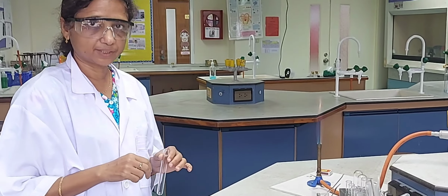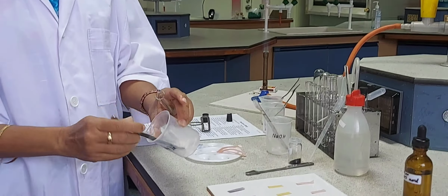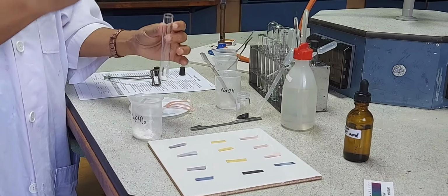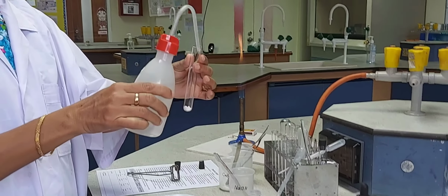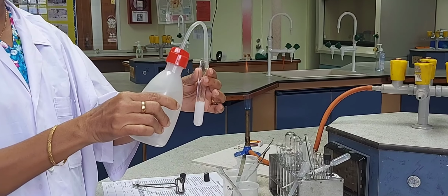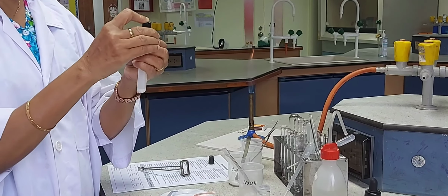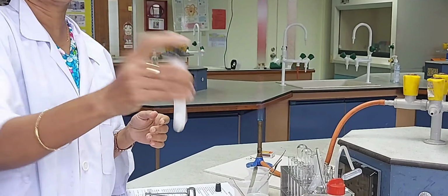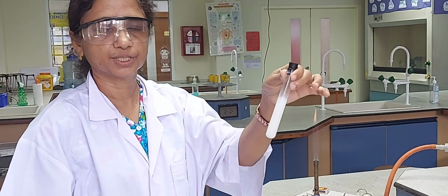The next base we will be testing is calcium hydroxide. So calcium hydroxide is a white powder. I take a quarter of a spatula in a test tube and try to dissolve it in water and see what happens. So there is a cloudy solution, and the soluble part will form a clear solution after some time.